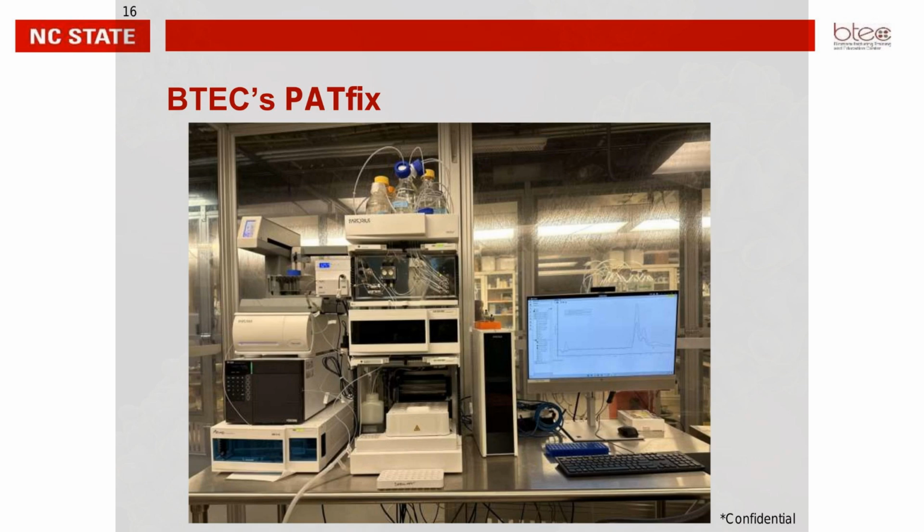The very interesting thing about the system is its ability to have multiple detectors in line. So by just injecting one sample, you can get a lot of information about the sample. The nice thing in our system is we have UV, MALS, fluorescence, and a refractive index detector as well. We can get multiple information through that. We also have a fraction collector, if you look up there, which is useful if you're running critical process samples and want to collect them.